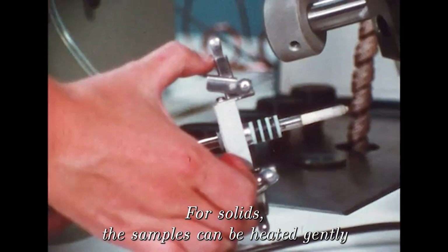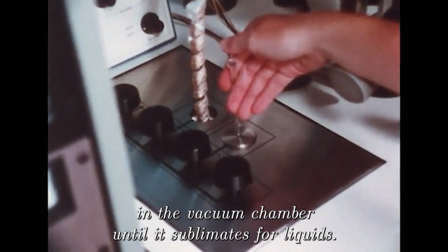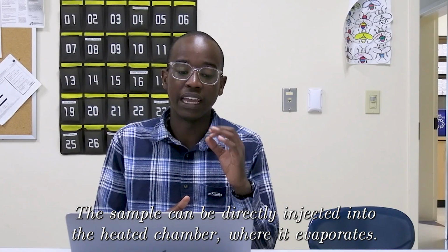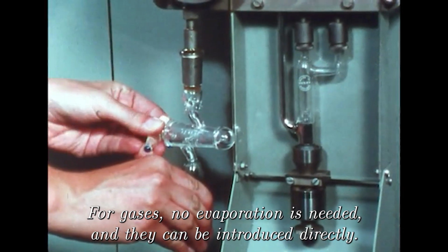For solids, the sample can be heated gently in a vacuum chamber until it sublimates. For liquids, the sample can be directly injected into the heated chamber where it evaporates. For gases, no evaporation is needed and they can be introduced directly.